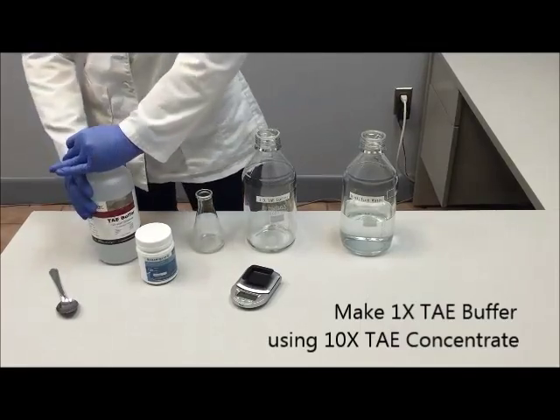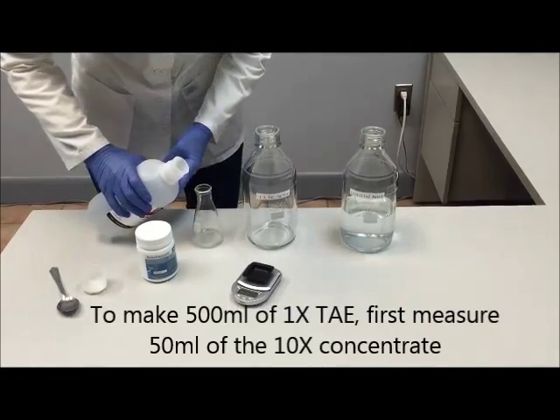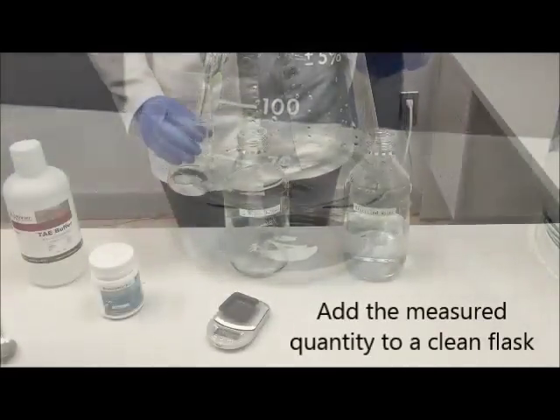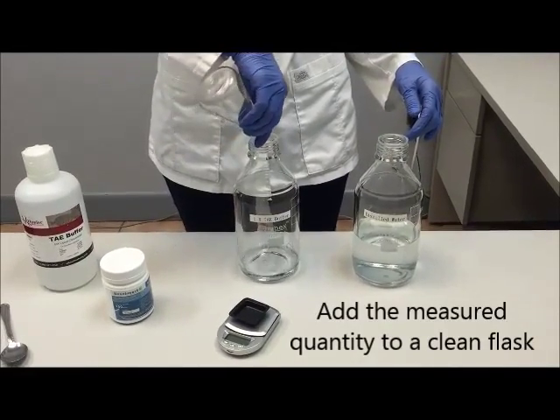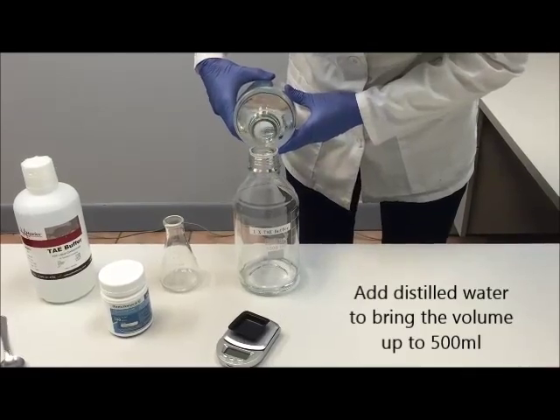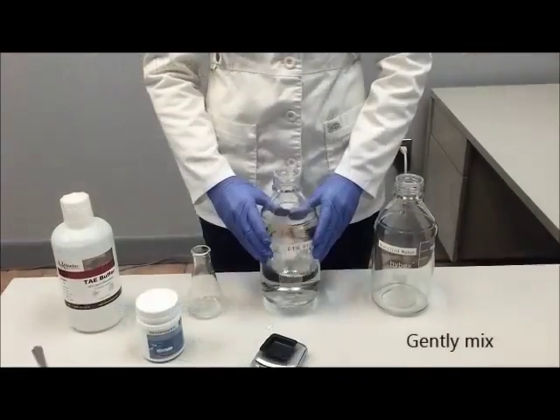Our first step is to make 1x TAE buffer using our 10x TAE concentrate. To make 500 ml of 1x TAE, first we're going to measure 50 ml of the 10x concentrate. We'll add this measured quantity to a clean flask, and then bring the volume up to 500 ml using distilled water. Then gently mix the solution.